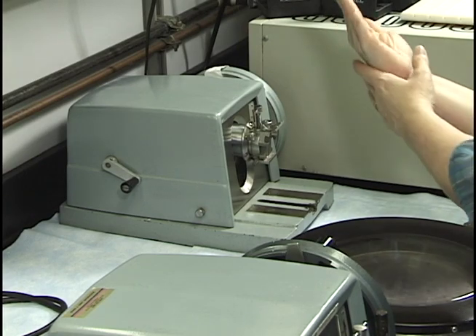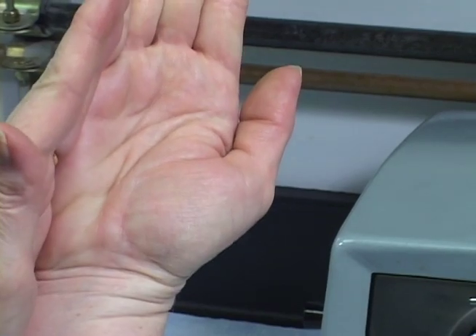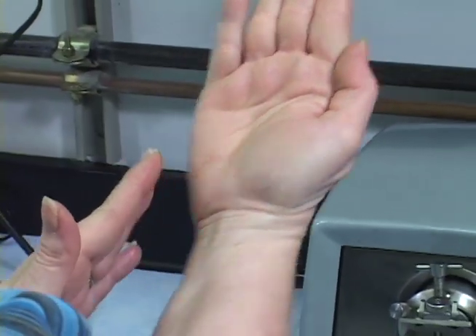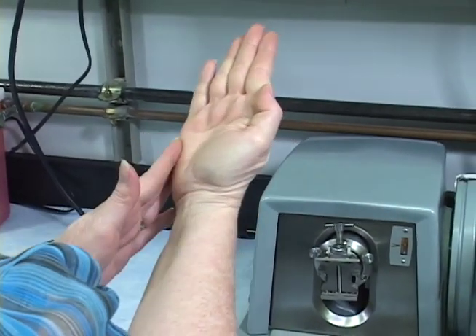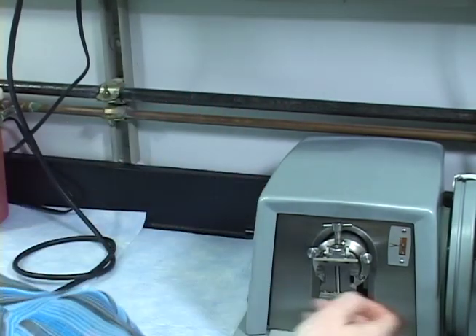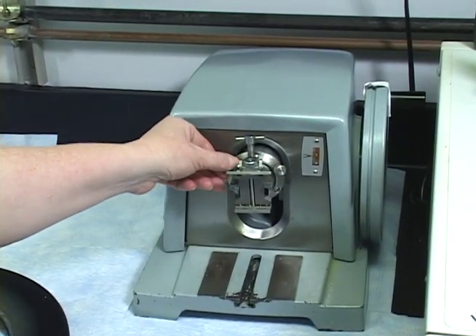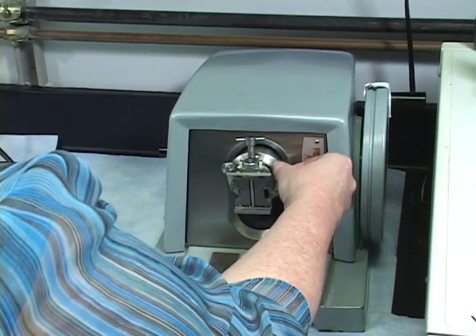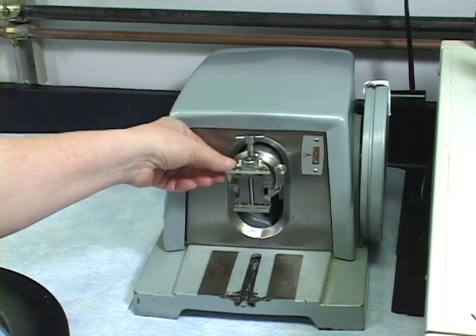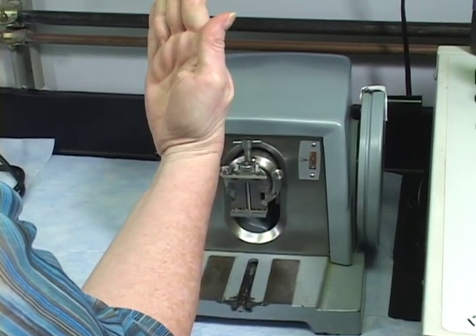Let's say this is my hand, I want to tilt the block this way, towards the right with this end coming out. If I want to tilt the block this way to the left with the right side kind of jutting out more, I would loosen this one and tighten this one. Loosen this one, and tighten this one. And that moves the block face going this way.